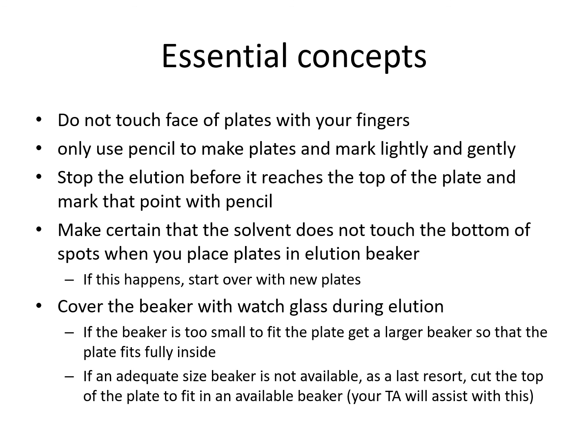Some solvents go fast and some go slow, but either way you have to remove the plate from the chamber once the solvent reaches above 75% of the length of the plate. And also you have to make sure that the bottom line does not touch the solvent from the beginning.